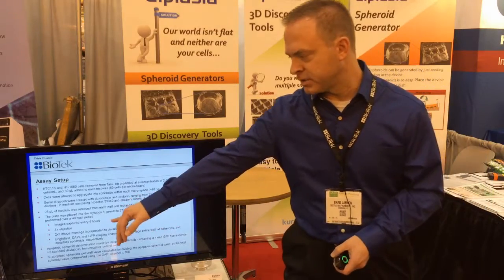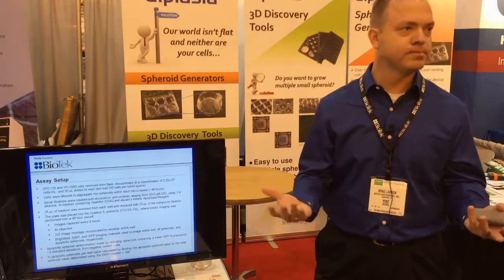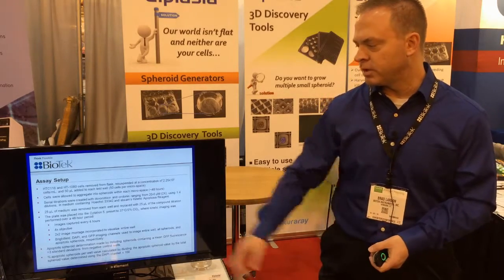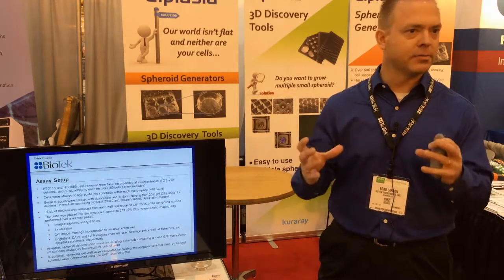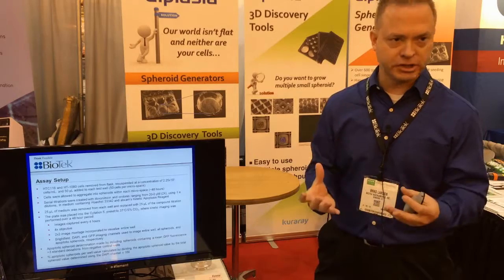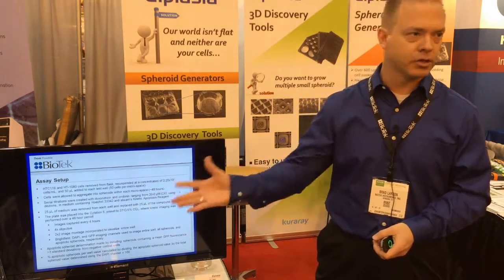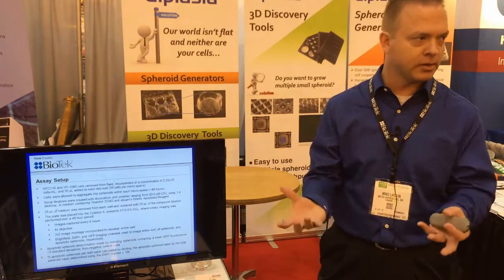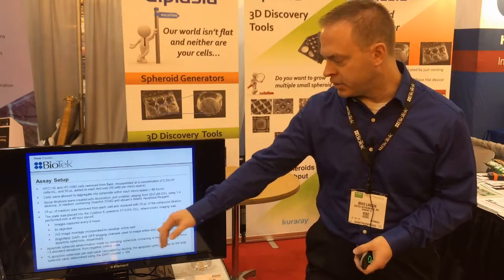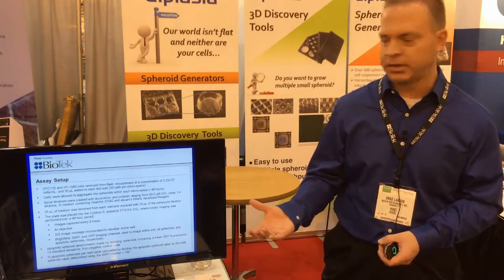We used a 4X objective for that, so you don't need high magnification to perform the imaging. With the plates, we did a 2x2 montage, which gave us a clear final image of the whole well stitched together with the software. Imaging was performed with brightfield to look at the entire spheroids, with Hoechst stain in the DAPI channel to get a total cell image, and the GFP imaging channel to monitor apoptosis induction.